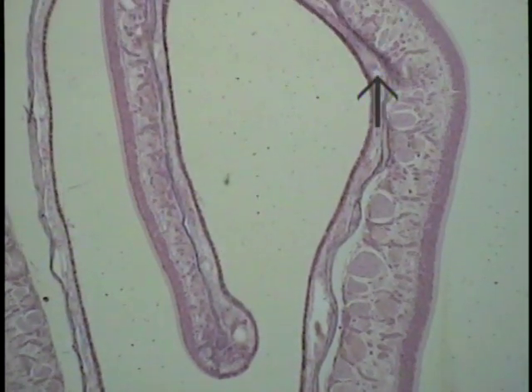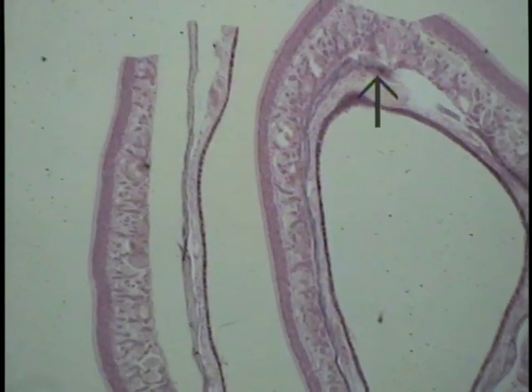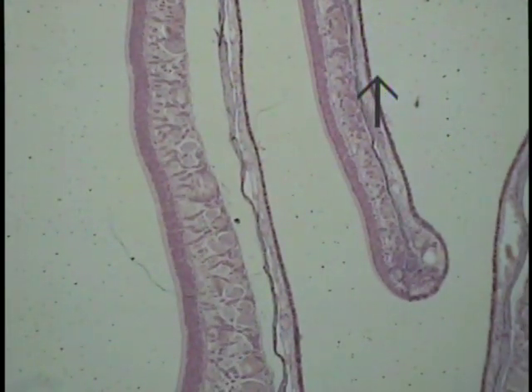This forms the interior support for the mucous membrane that lies on either side of this particular conch bone that lies within the nasal cavity. So it lies at the interior of this particular structure that is scroll-like in nature.